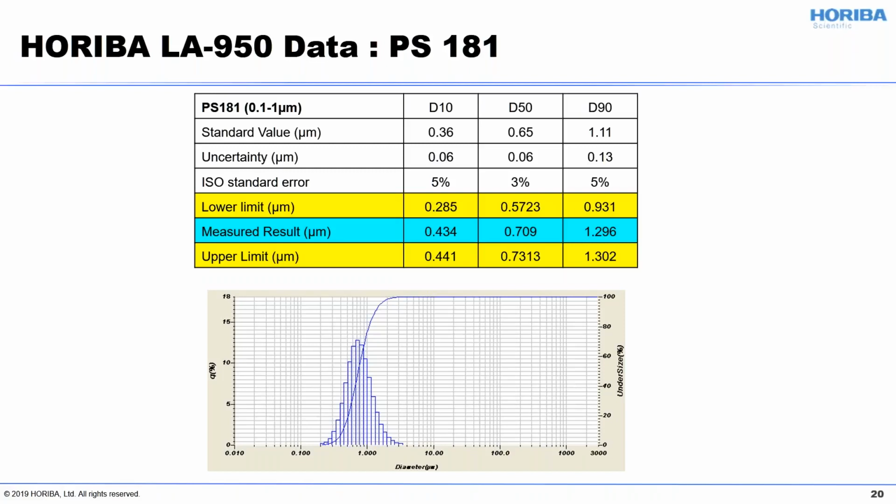So that's an issue. It could be that you have something in your analyzer that is adding particles to the system. For example, if you used something particularly sticky and didn't clean it out very well, or if your colleagues did, you could be seeing extra particles in your measurement, and you need to clean the system. And finally, if you really can't get it taken care of, then it's time to figure out what's wrong with your analyzer. But the first place I would look is the calculation, because that's easiest.